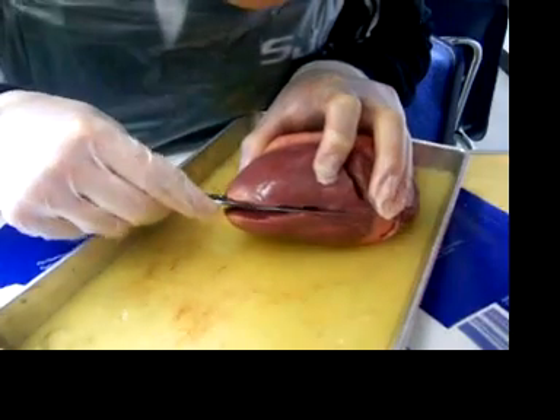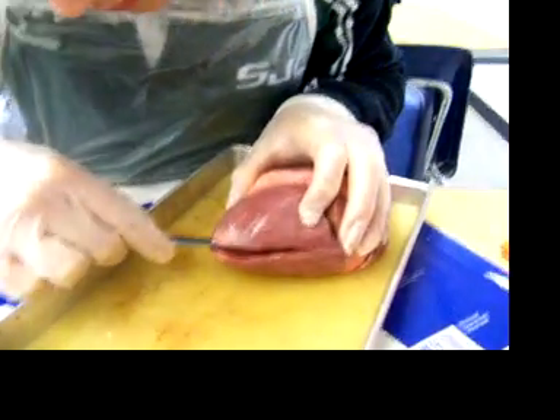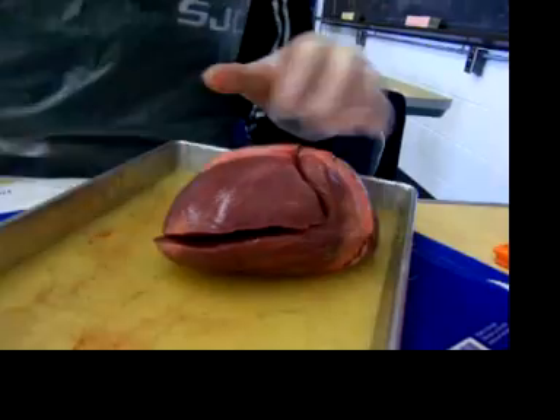The cutting of the heart. Can I make the other cut? Yeah, sure. Go ahead. What's the other cut? All the way up. You gotta cut all the way up.